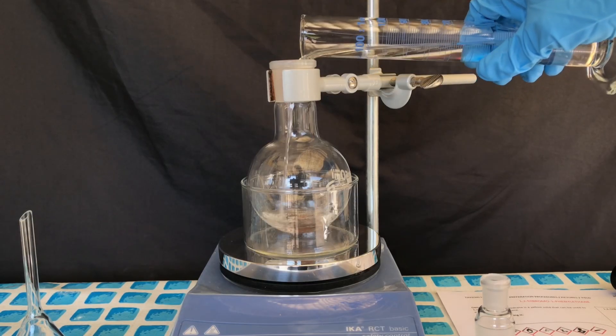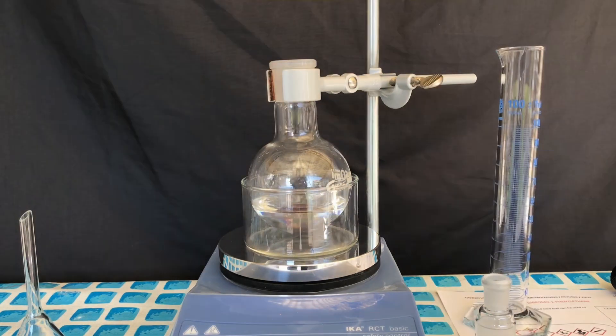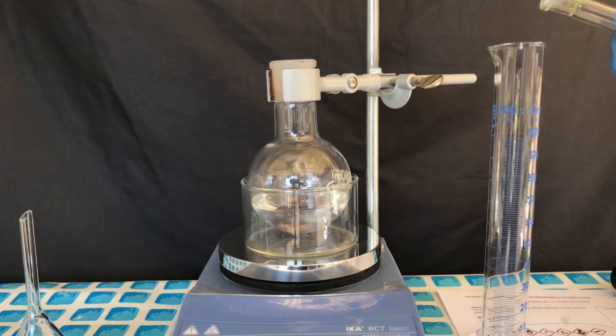While being careful to keep the ground glass joint somewhat clean, the styrene was added, followed by about 50 ml of dichloromethane.